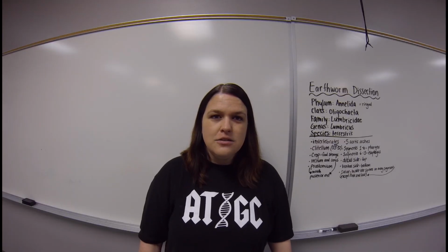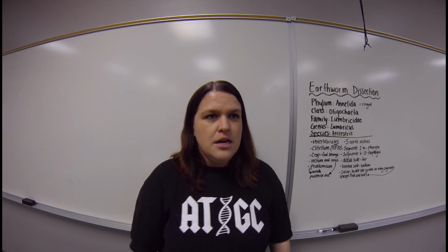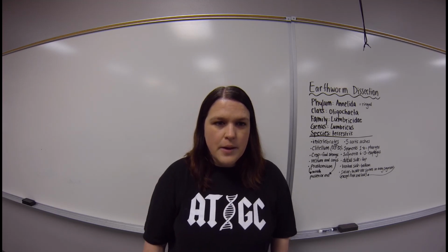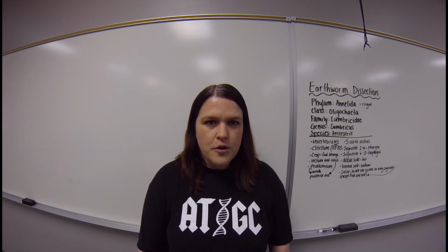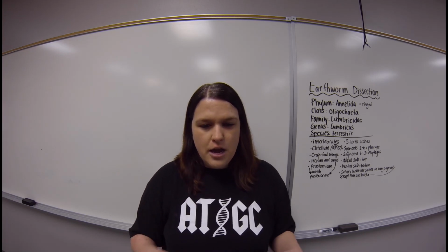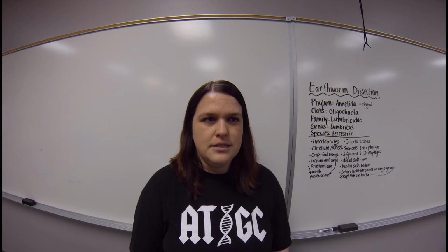Hey guys, so today we're going to go over the introduction to the earthworm dissection. The earthworm that you're going to dissect with me digitally, virtually, is a night crawler. If you've ever gone fishing or you've dug these up as a child in your yard, you know that night crawlers are a little bit bigger earthworms. So that's what we're going to be looking at today.